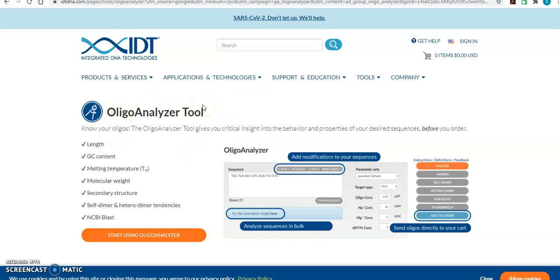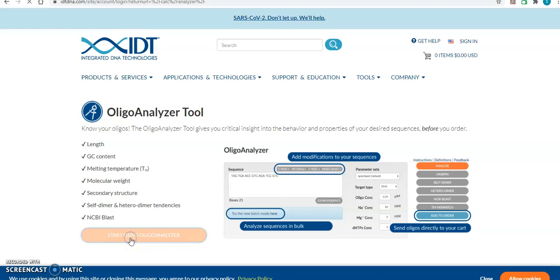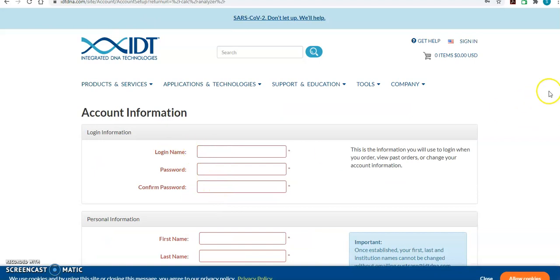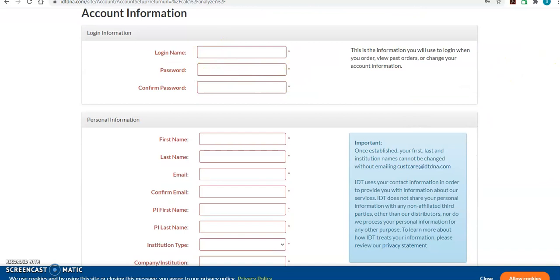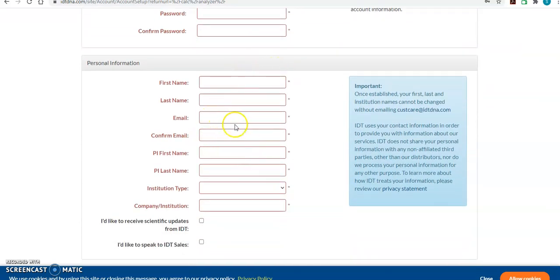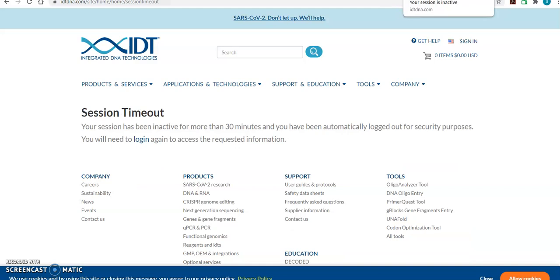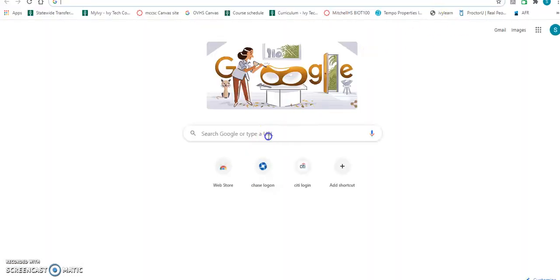This is the IDT company website. In order to use the oligo analyzer tool you need to register. Click on 'Start using oligo analyzer' and then click 'Register' if you don't have an account. Fill in your information: a login name, a password, your first name, email address, PI information — you can type my name and Ivy Tech — and once registered you can start using their website.